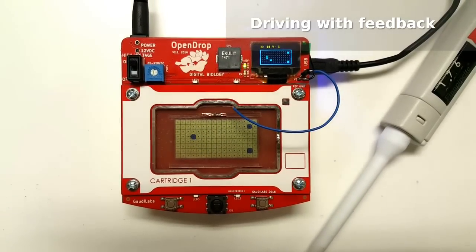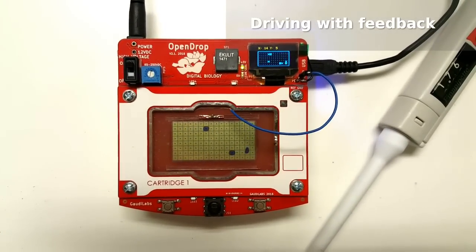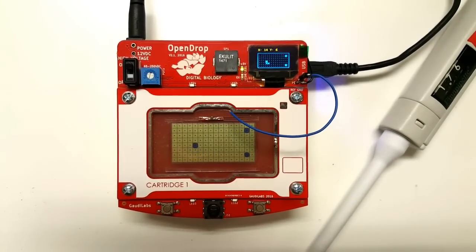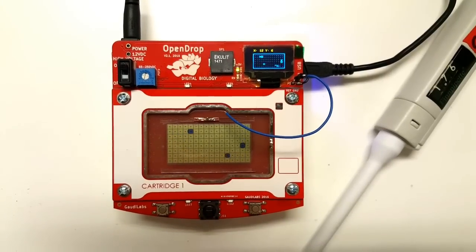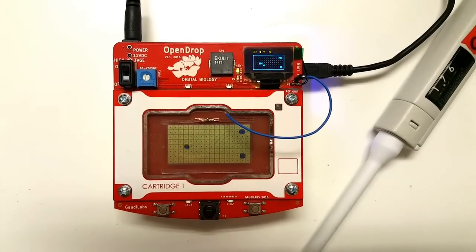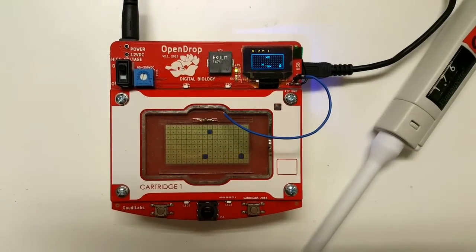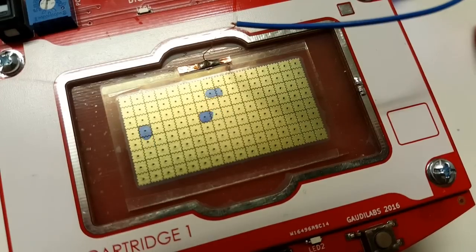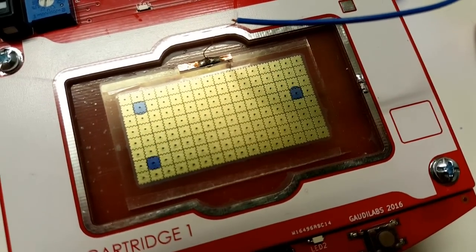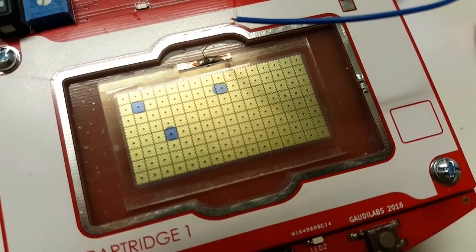Now the droplets are driven with feedback, which means the OpenDrop electronics can control the movement of each droplet. As you see, when one droplet gets stuck, the other will wait until it's finished to reach its position. The faster droplet waits for the slower droplet to reach its position.